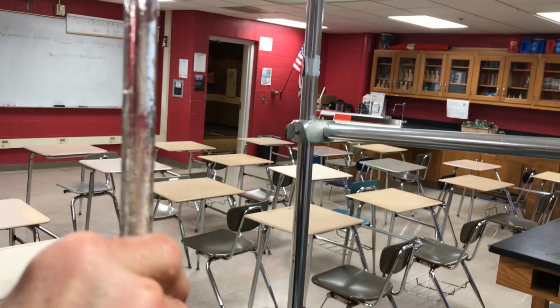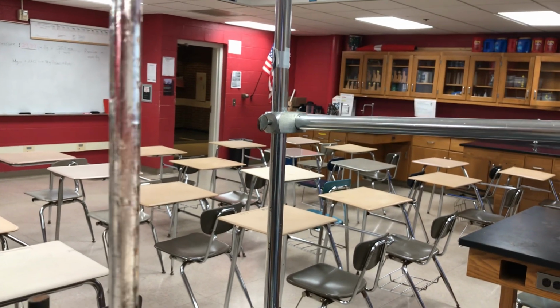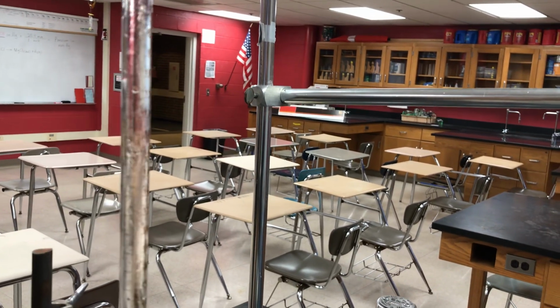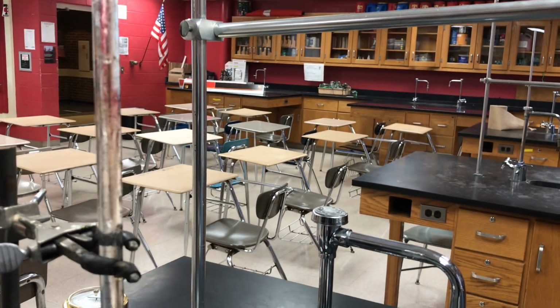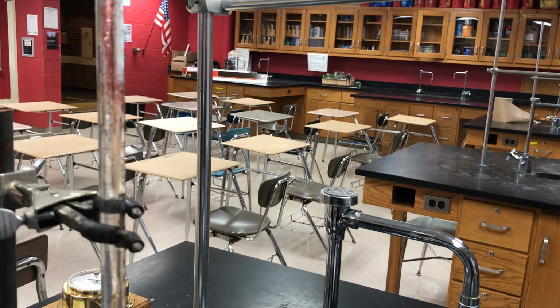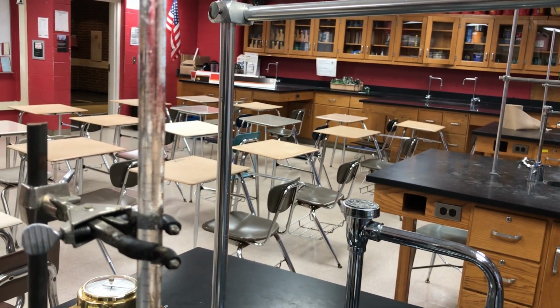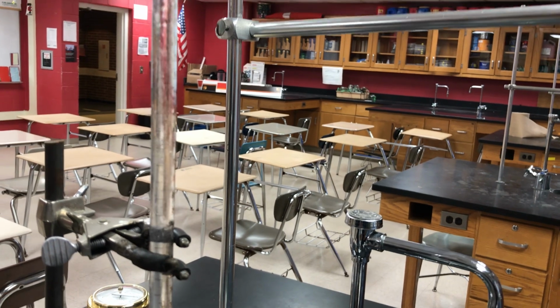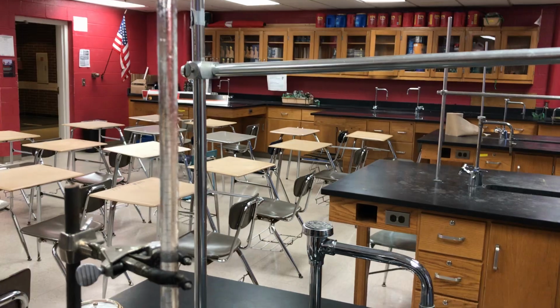You can see kind of a churning of the liquids as that more dense HCl starts now to sink down into the water. See that happening? Water is really mixing well now with the HCl.